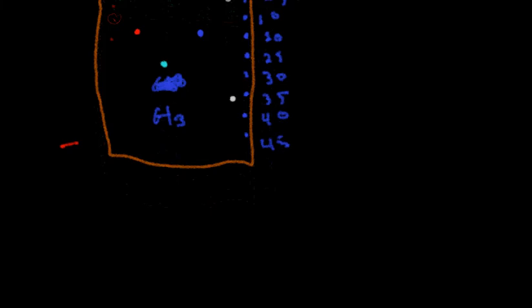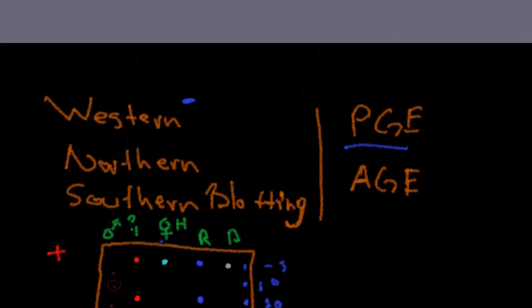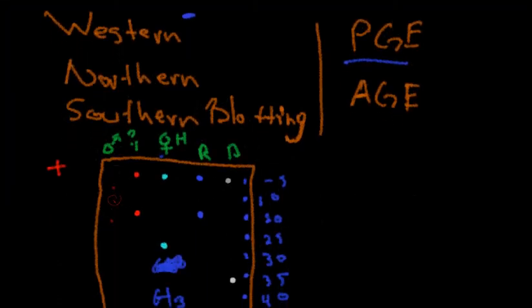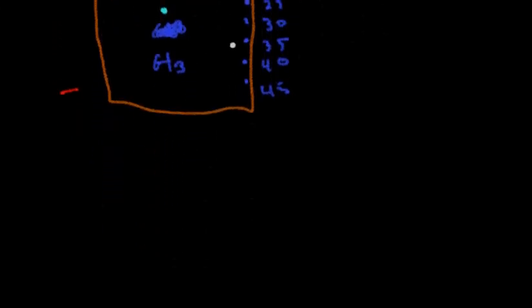So that allows you to look at the gene end product. Now, as a geneticist, that's not necessarily all that fascinating. So the next thing we may be interested in is the gene production itself, the RNA. If you want to study RNA, maybe what we want to know is gene expression. How many copies of the gene are being turned out? So we might know what the RNA for a given gene, like cystic fibrosis, actually looks like.